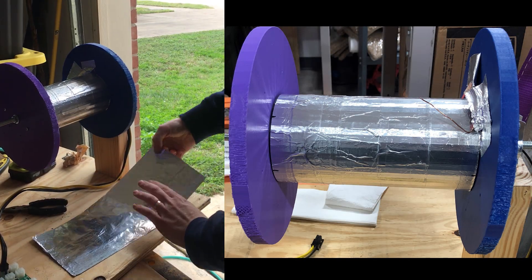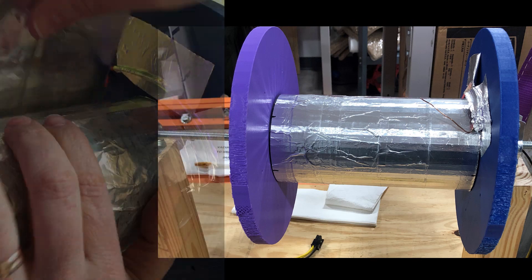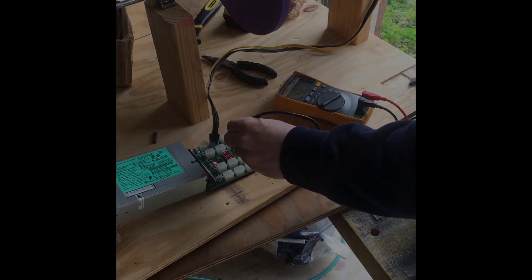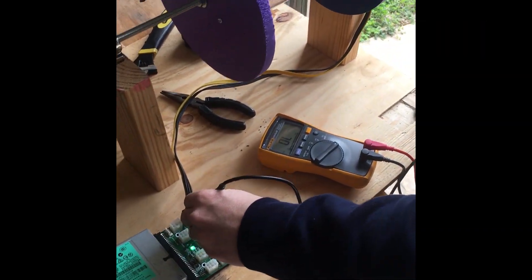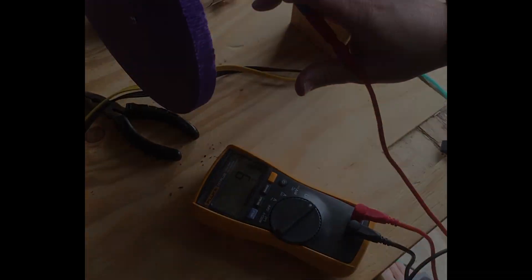For your spinning test: conduction — here we have continuity, and we have continuity here. Here we go.